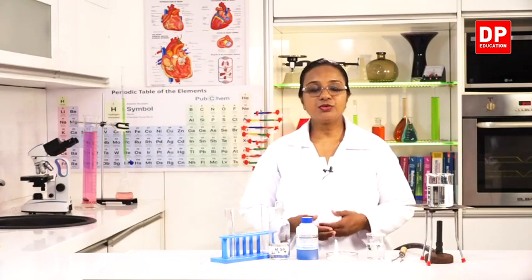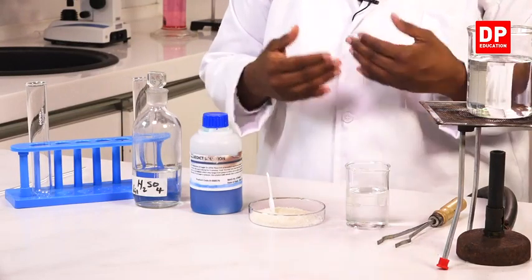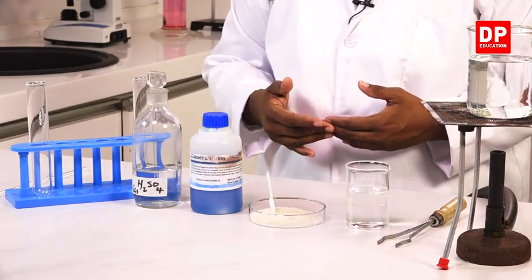Okay students, now we will do the activity to test the presence of sucrose in food samples. For that, I will be using sugar, the normal sugar from the household kitchen, that is sucrose. And the reagent that we are going to use is Benedict solution. In addition to that, as I explained to you all, we will be needing dilute sulfuric acid.